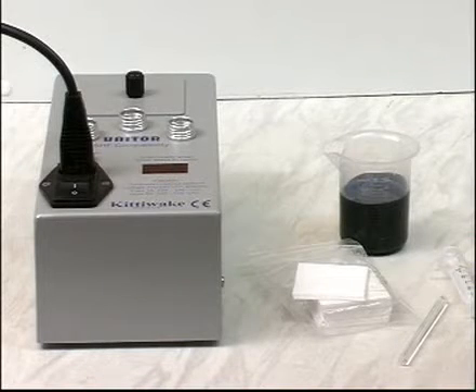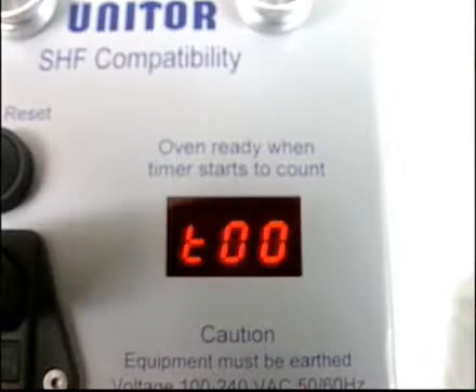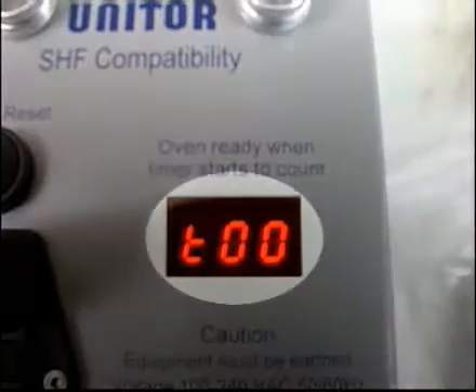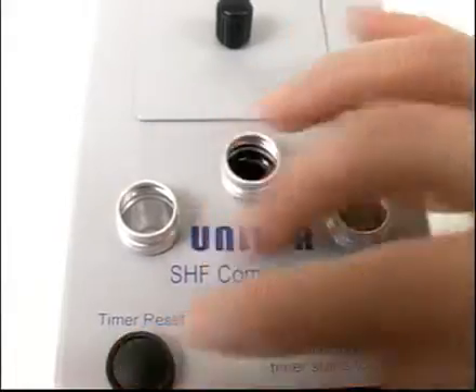For how to set up the equipment, see the timer section in your user manual. When the equipment is heating and not yet ready to use, it looks like this. When the equipment is fully heated, the timer looks like this. It counts in minutes only, from 0 to 99, and can be reset by pressing the reset button.